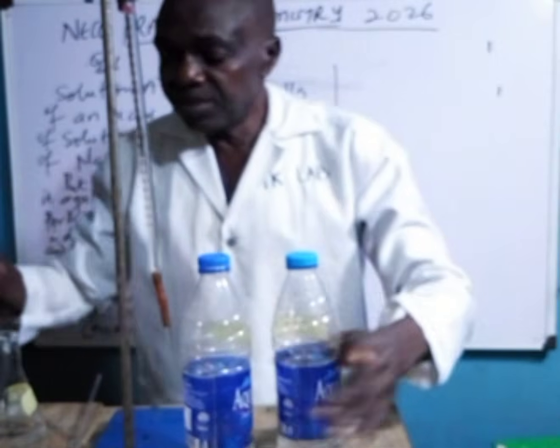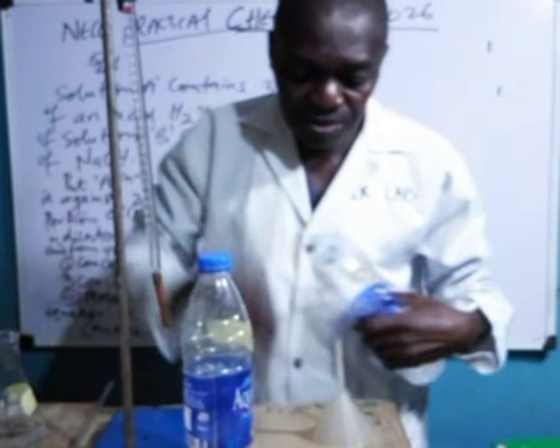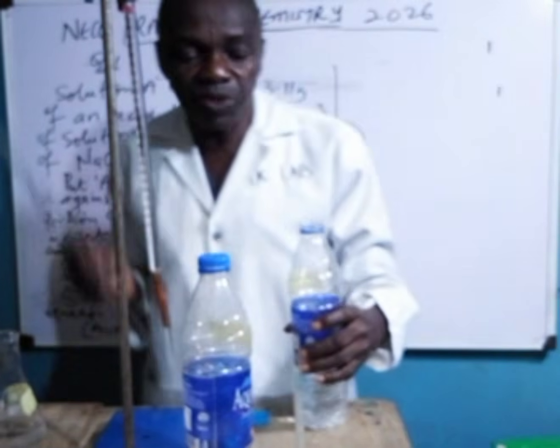Then we'll go for the base. This is the base. You have to use the pipette to take out some quantities.